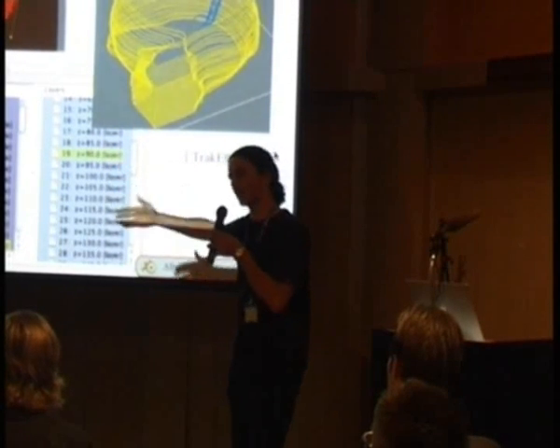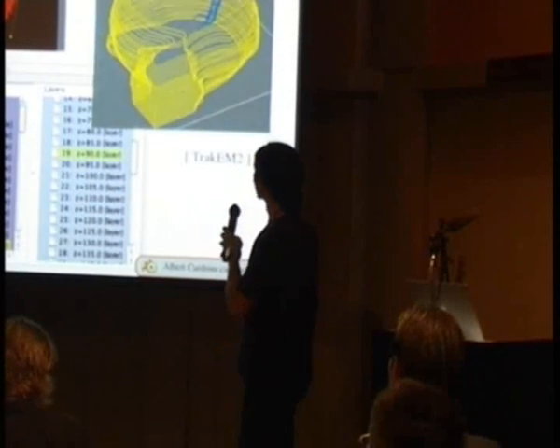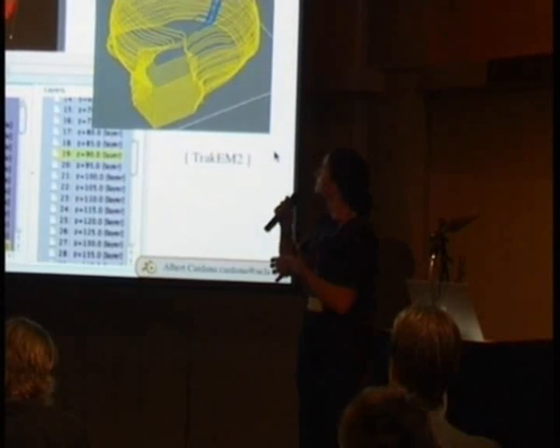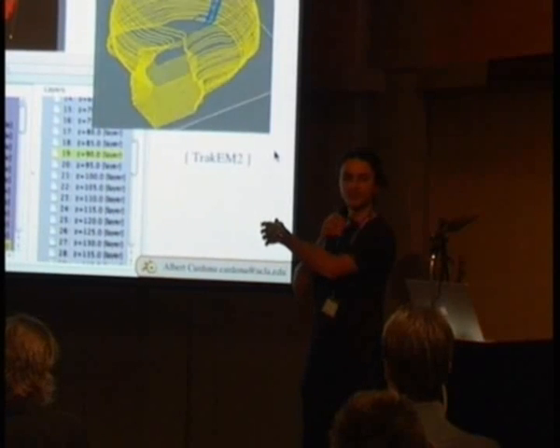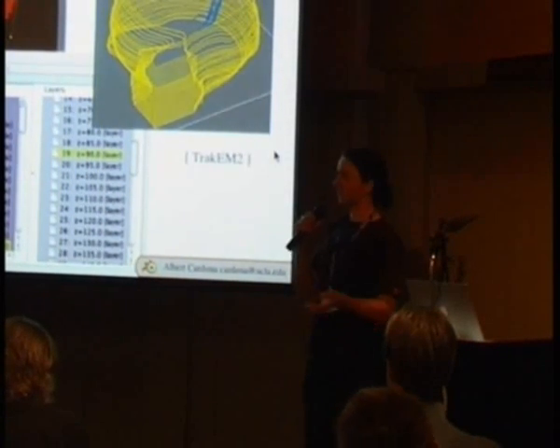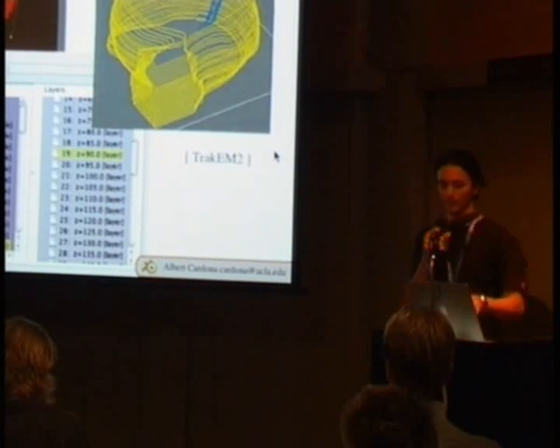These images are layers of the sample, so they represent a volume. Then I can quickly have a look at how these contours look. I'm left with the problem of making a 3D out of all these contours, which is also an old problem of triangulation and making some nice skin out of it.